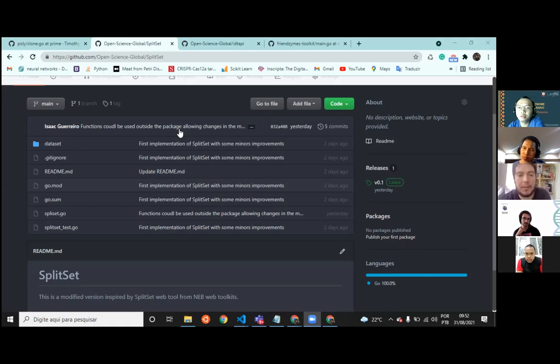Yeah, I think we already have the security level for making genomic transformations in general. So I think this is not a problem. Actually, if we're doing PCR, you already have enough biosecurity for this, I think. I could double check with Isaac, but I'm fairly sure that we don't need more than this. The biosafety level for doing this is level 1 because E. coli and B. subtilis are all non-pathogenic. So the problem is the organisms that you use, not the process. The process is not dangerous, but the organisms that you use to modify are the problem.